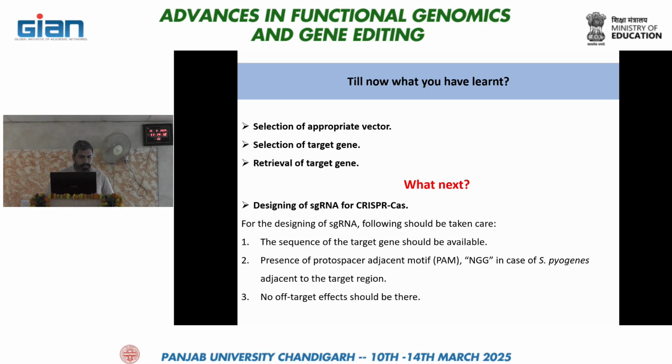And the third is that while designing the target region, there should be no off-target effects, like your target shouldn't cut some other gene. It should be specific, like how we design primers, if you are aware of that, it shouldn't be able to bind somewhere else. So no off-target effect should be there.